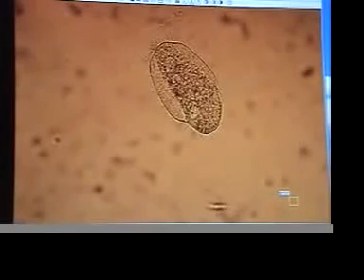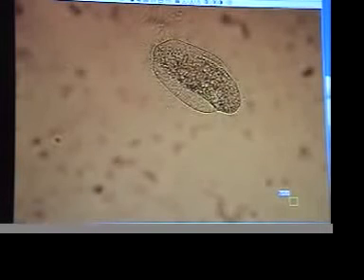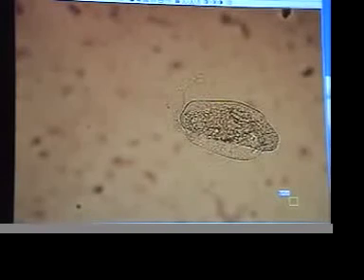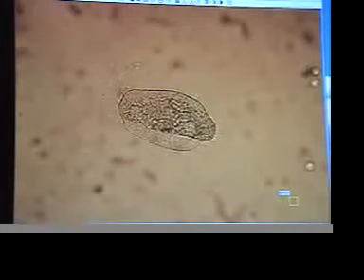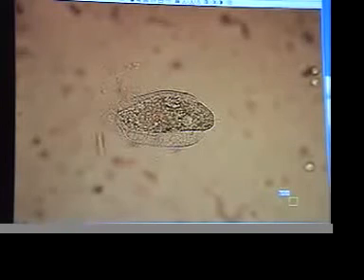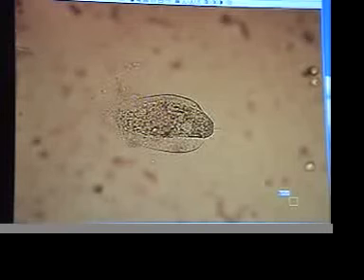Let's back out a little bit. Yeah, I think we're seeing a morphological transformation. That's why it's moving. He's transforming in real time. Very good. Just straighten the center of the picture a little bit for you. Morphological transformation of the protozoa Paramecium caudatum. July 23, 2008, caused by exposure to a Rife-Bare plasma device.